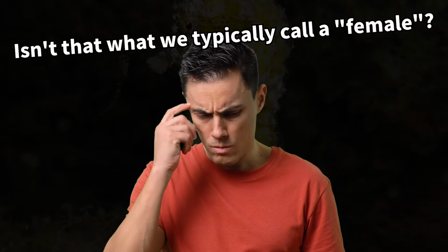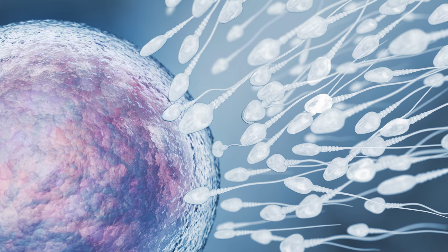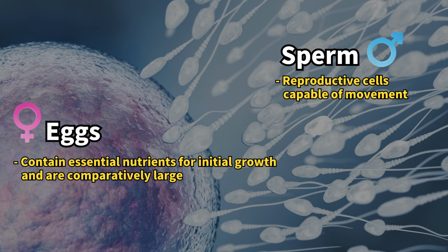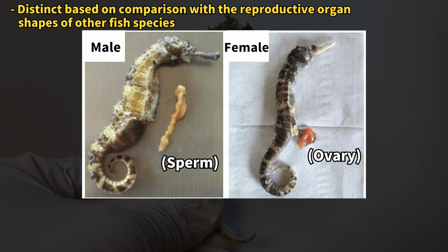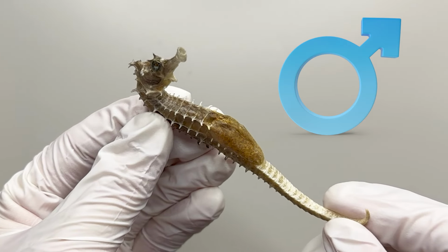Interesting, isn't it? You might be thinking, but if it's pregnant and giving birth, shouldn't it be female? Actually, the simplest way to tell females from males in biology is by looking at their reproductive cells. Male seahorses produce moving sperm, and the structure of their reproductive organs clearly shows who's male. So the one with the pouch is definitely a male.